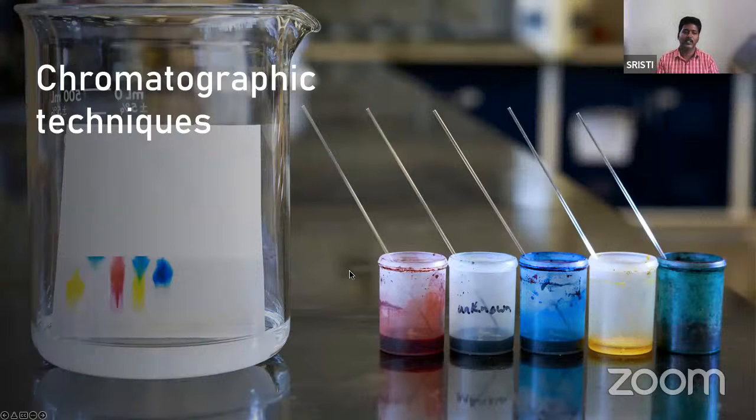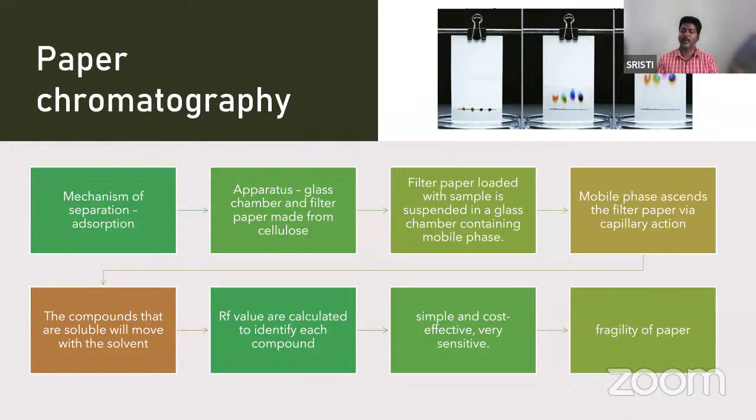So next are the chromatography techniques. Coming to the chromatography techniques, the first one is paper chromatography. The mechanism of separation is adsorption. You need only a very simple apparatus: a glass chamber and a filter paper made of cellulose for separating and identifying a compound. The filter paper is loaded with the sample and suspended in a glass chamber containing a mobile phase, which will be the solvent, with different solvent systems.